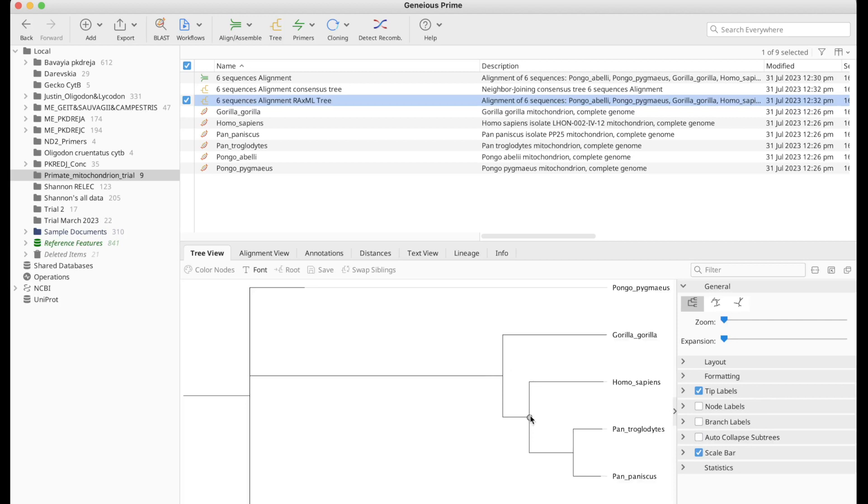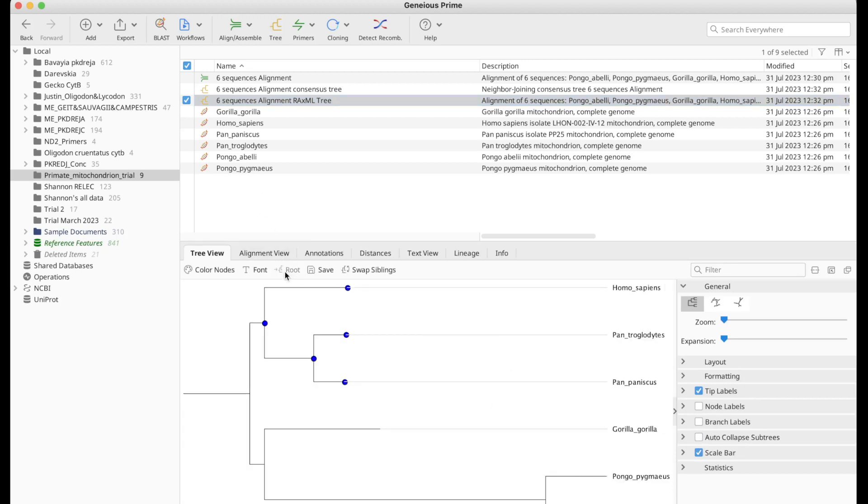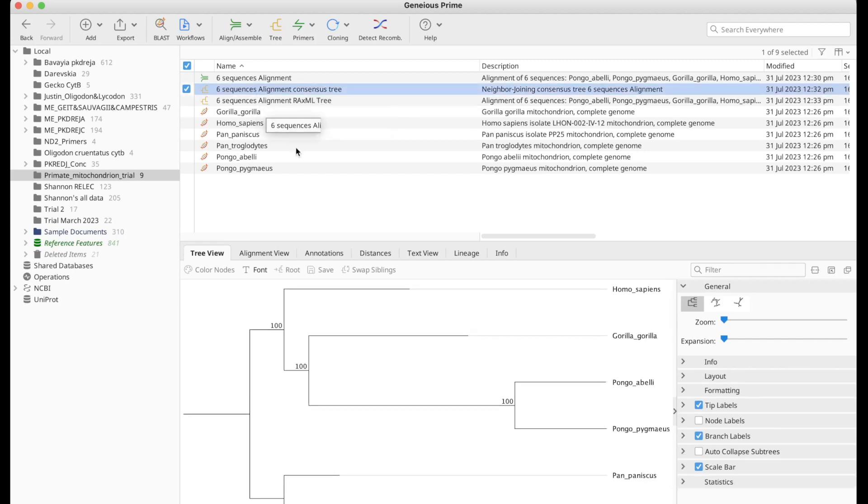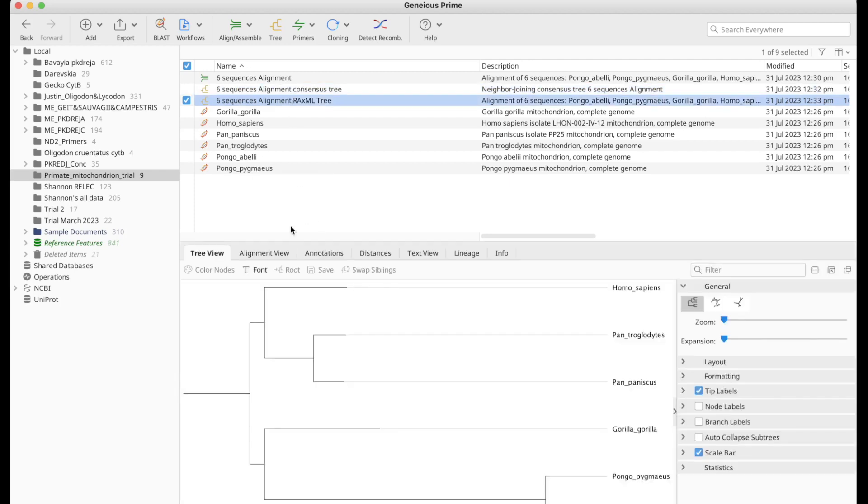So I would like to reroot this tree as well. And this is what we got. So the differences are pretty obvious within these trees. One is not better than the other in all cases. In this case, we know that the closest relatives to Homo sapiens, so the humans, are actually bonobos and chimpanzees, which is not reflected in Genius Tree Builder. But we can actually see that in RaxML Tree.